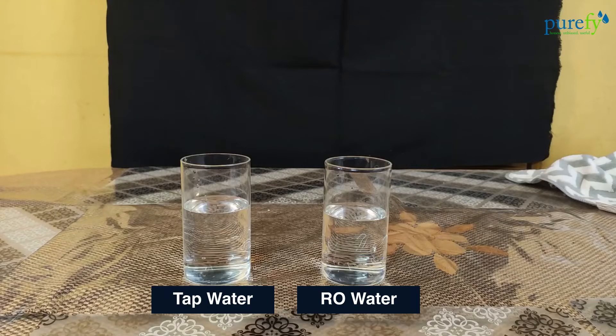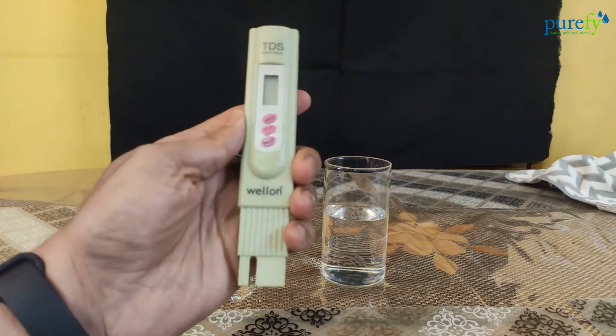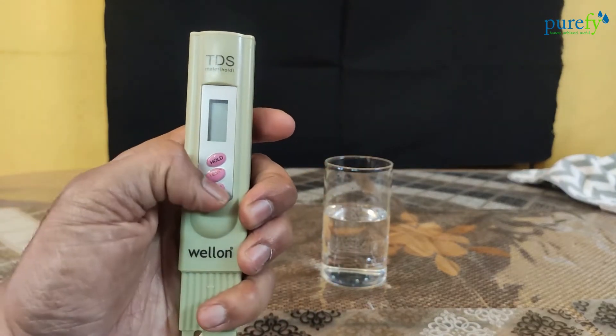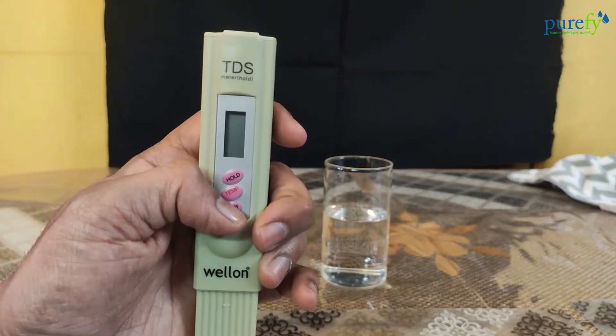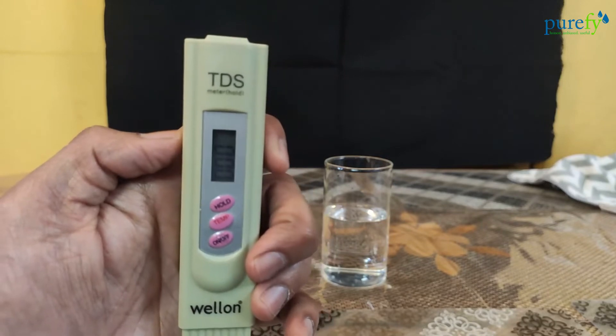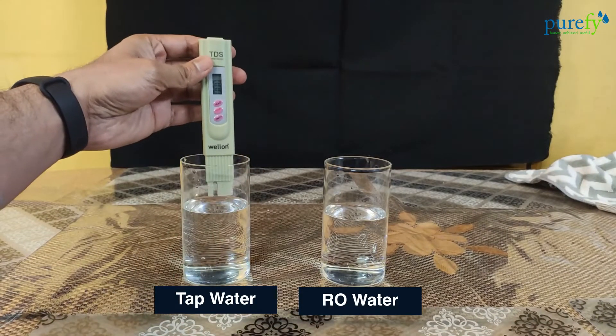Let's first test the TDS level of the tap water. The tap water supply we have at our home is groundwater or borewell water, so naturally the TDS level would be a little higher compared to municipal tap water. Let's turn on the TDS meter and take our first reading. When you turn it on, the display will show a zero reading. Now immerse the TDS meter till the maximum level.